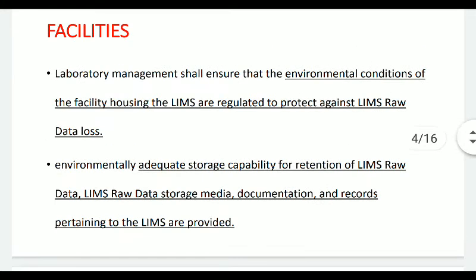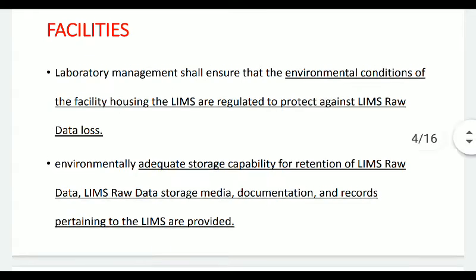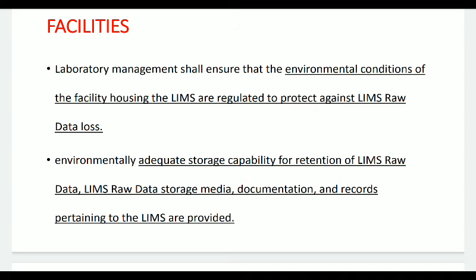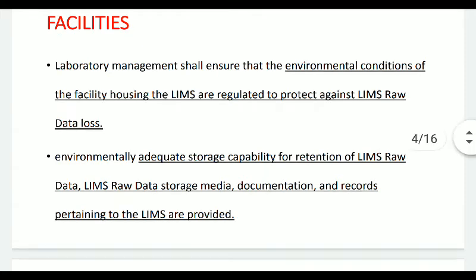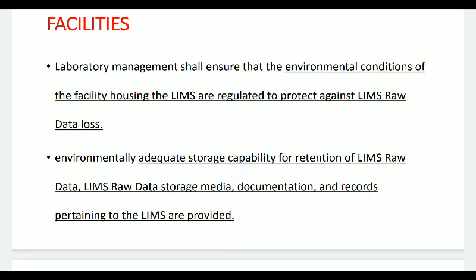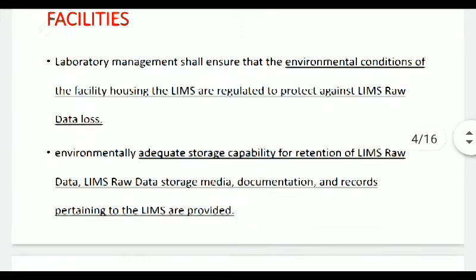Now, in a nutshell, you can understand it in this way: normally when we are using computers, when we are using these digital systems, we ensure a dust-free environment. An air conditioned room or laboratory is preferred, and a complete dust-free environment is needed in order to ensure the most efficient work of the computer system. Suppose we are not following proper guidelines, it may lead to the malfunction of the computer system, and that will eventually lead to the loss of LIMS raw data.